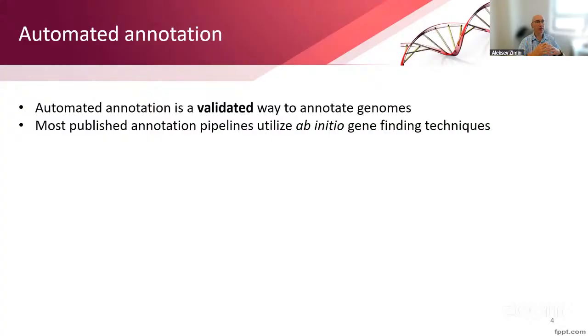So this is in principle a new annotation pipeline, and I would ask, has this new approach, this new combination of tools, been tested in real life on multiple genomes? And as a result, if there is no testing data, how can I trust this annotation that's been produced by a combination of existing tools?